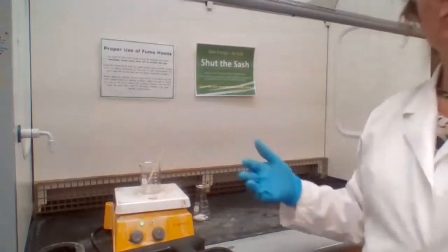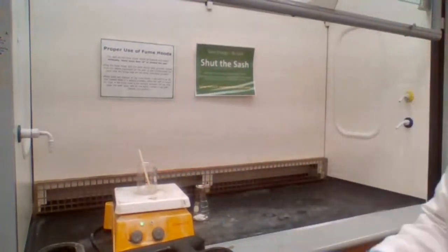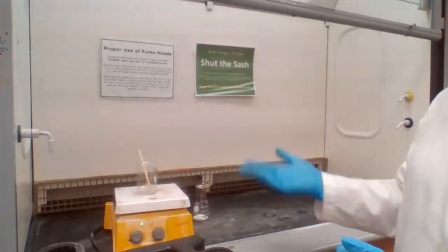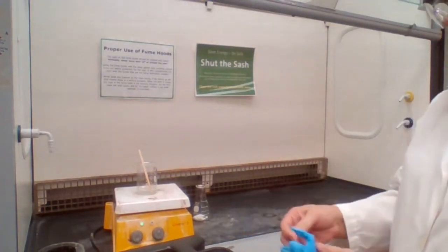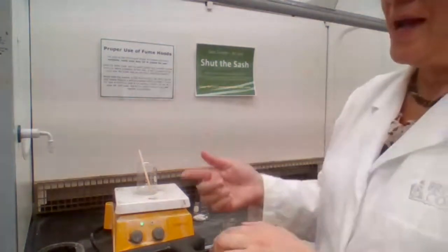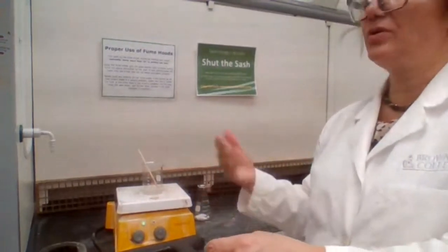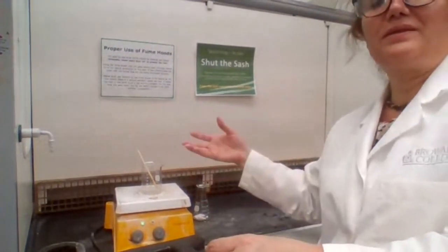Ether is going to boil at a much lower temperature compared to ester. So when the ether is done boiling, it would require a much higher temperature for the ester to boil. So ether would boil first. You won't see any bubbles forming when all the ether is gone. It takes a long time before the ester starts boiling. And for us to be smart, we have to take the beaker off the hot plate at that point, because we do not want to decompose or evaporate the ester. We want to keep the ester. We want to evaporate the ether.